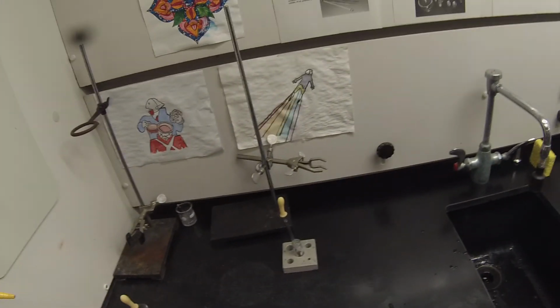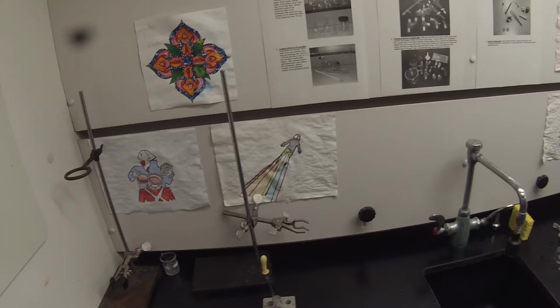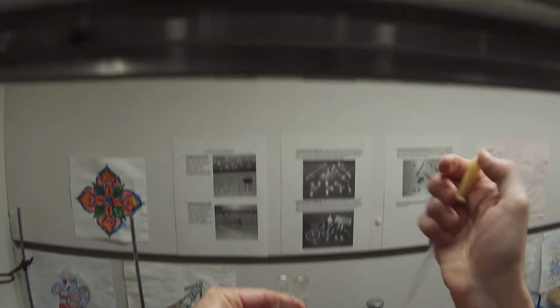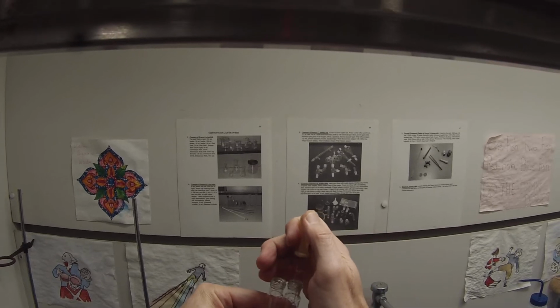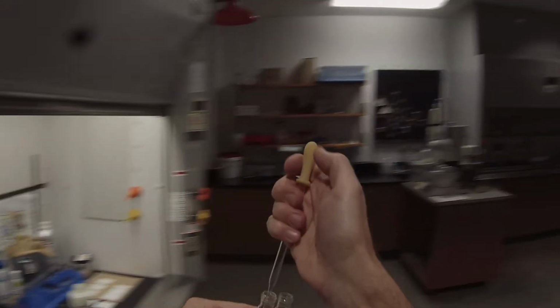In the lab manual, I believe it tells you to add the drying agent to this tube, but you can see there's a lot of water on the sides of the tube, so we will end up having to use less drying agent if instead of adding the drying agent to the tube that's already wet, we add the contents of the tube to a nice dry centrifuge tube. Hold those so they're nice and close to each other. Pull that out of there. I lose a little bit in the pipette, but less than I would lose by using extra drying agent.